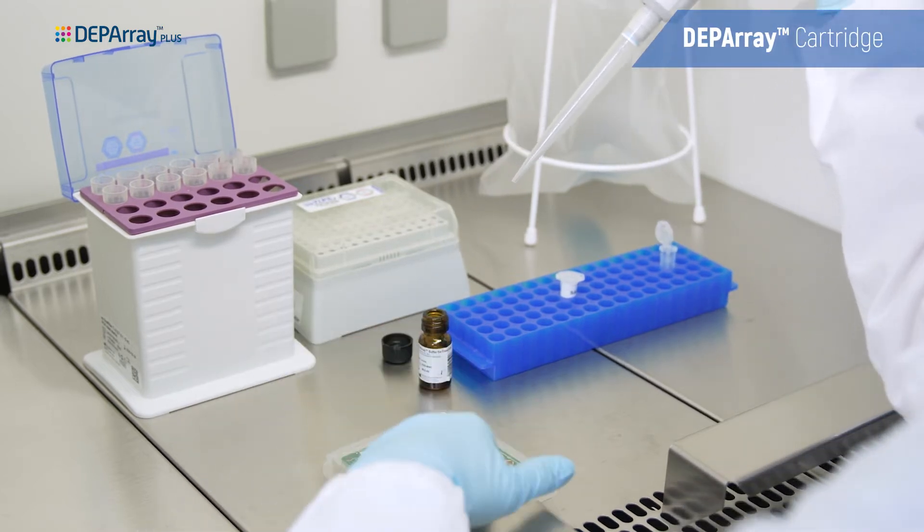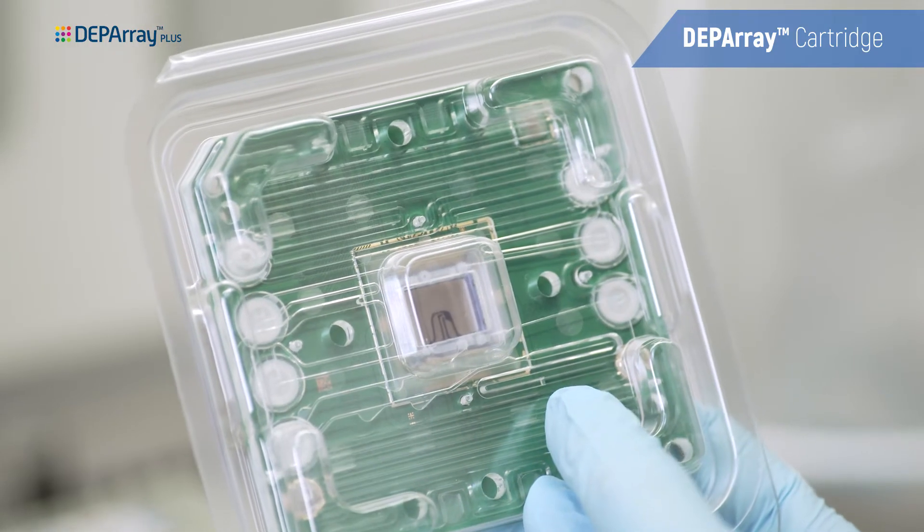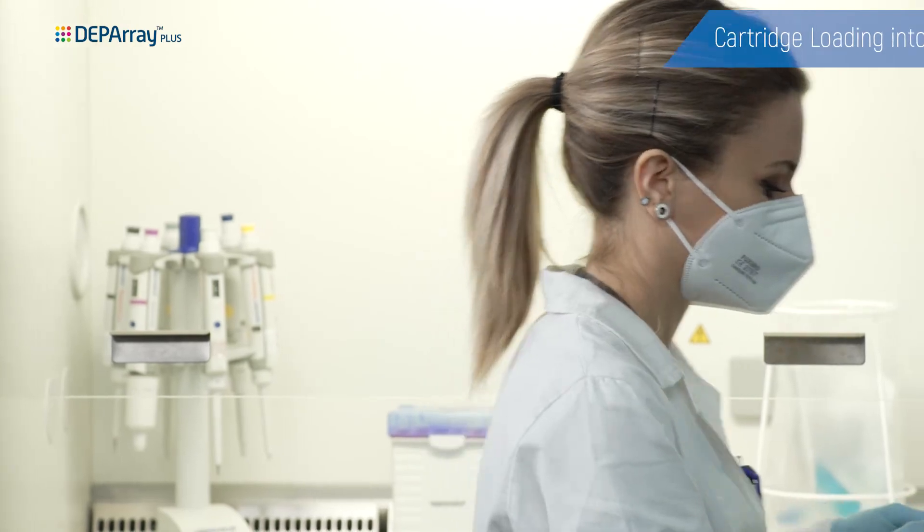The Depore single-use microfluidic cartridge has a core semiconductor chip that enables individual cells to be separated and collected with very high precision.